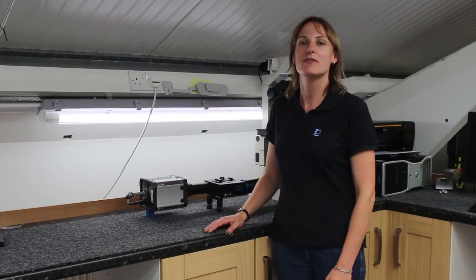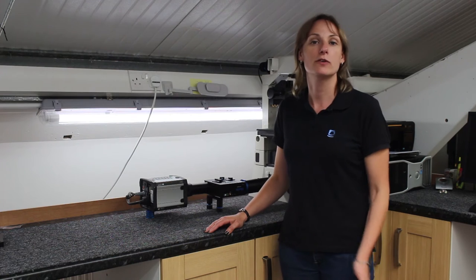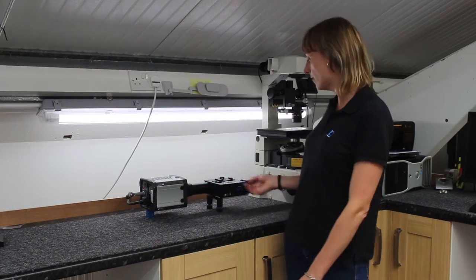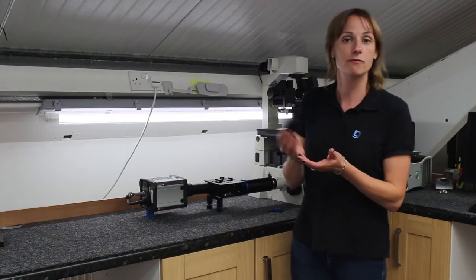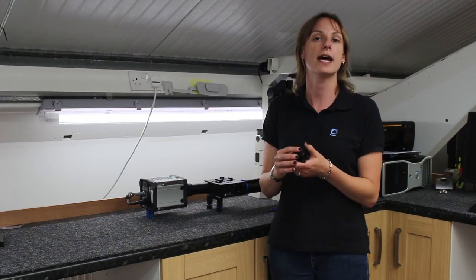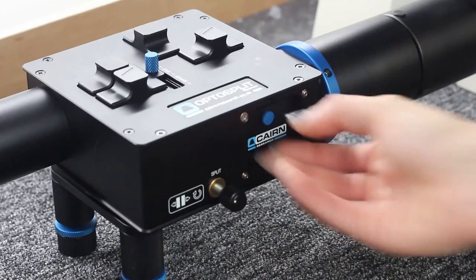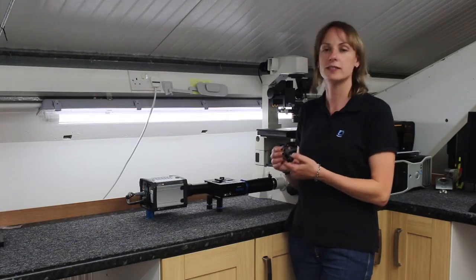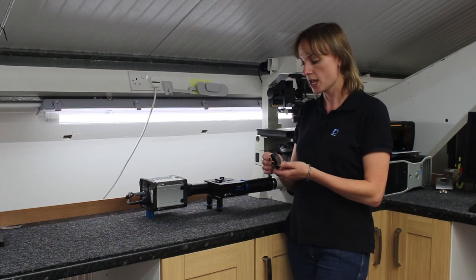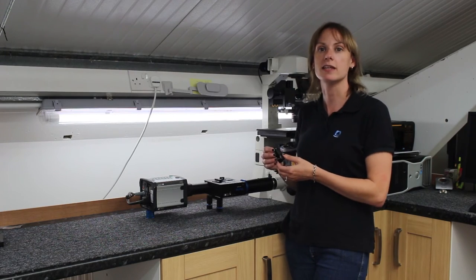The second key benefit of the Bypass unit is that we've produced it with high-end imaging techniques in mind. For super resolution microscopy in particular, reproducibility and stability are essential. With that in mind, we have redesigned our filter cubes — they're exactly the same as previously except they've got no mechanical attachment on the top. There are magnets that relocate the cube for improved reproducibility. We've also increased the size of our auxiliary drop-in components to improve the registration, and it allows better access to the pupil plane to allow multi-Z imaging much easier than previously.